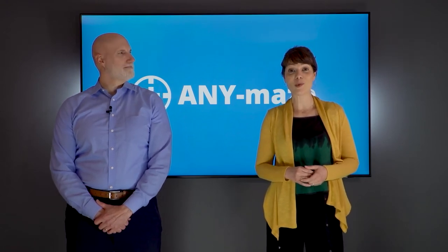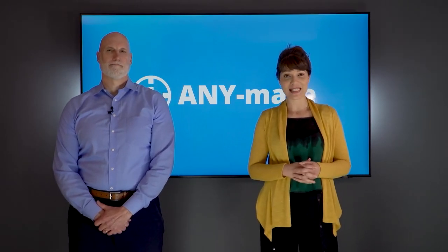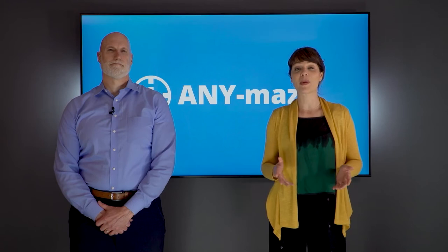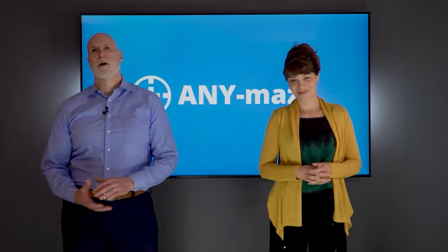That's right. ANY-maze was developed 20 years ago as a video tracking system, but since then it has developed into a broad platform that can be used to automate all sorts of behavioral tests, including ones that do not use video tracking at all. As to why you'd want to use ANY-maze to run operant experiments, well, that's the question we're going to try to answer in today's webinar.